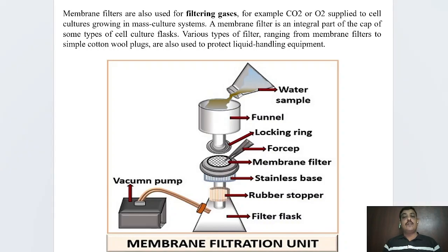Students, we were discussing various types of sterilization methods which is usually performed with cell culture. And in the last video, we had discussed different types of sterilization methods, and we had discussed wet heat sterilization. We had discussed an example of autoclave. Followed by that, we had also discussed dry heat sterilization. Under that, we had discussed hot air oven, and followed by that, filtering type of sterilization.